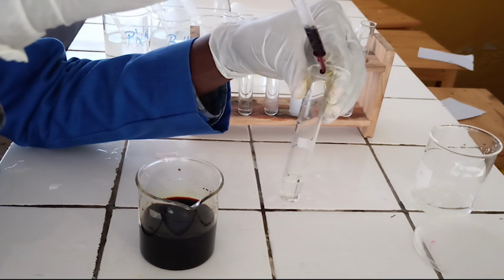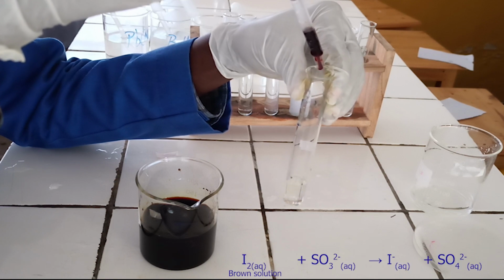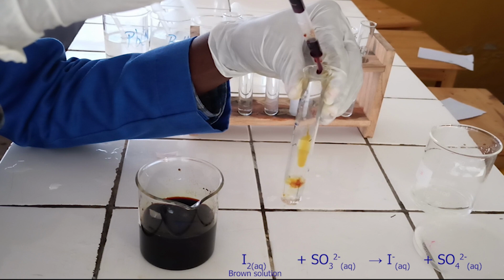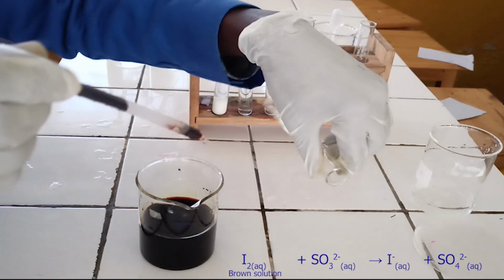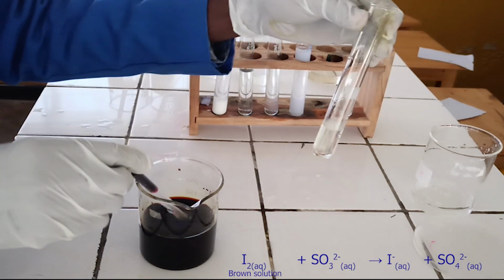As you see, iodine solution reacts with sulphite ion. During reaction, brown color of iodine turns colorless. Below, there is the ionic equation for this reaction.